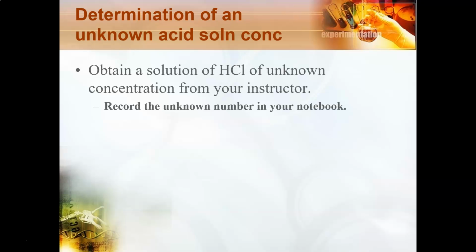Okay, so now you're going to get a solution of hydrochloric acid, and those will be prepared by Dr. Williams. So please don't forget to record the unknown number in your notebook, because we will need to check that to see if you got it right.